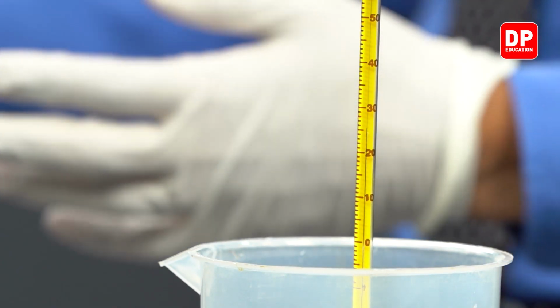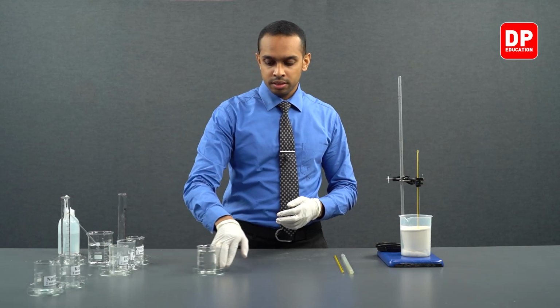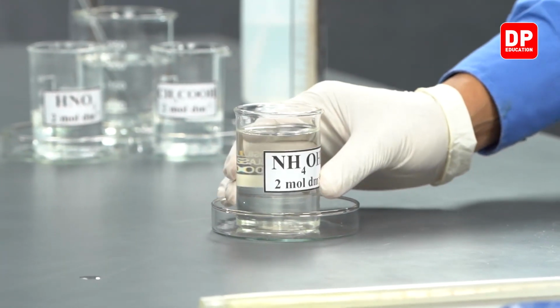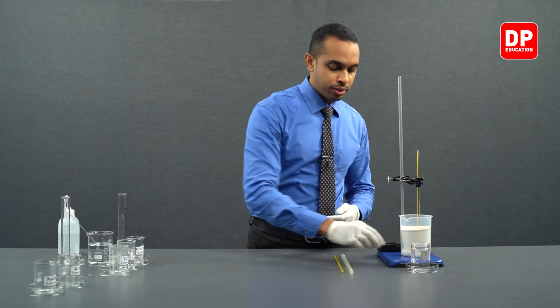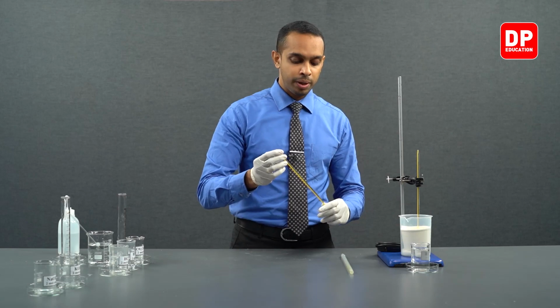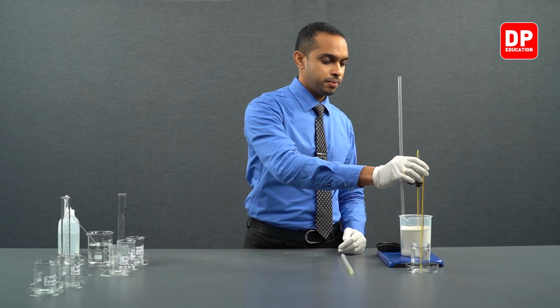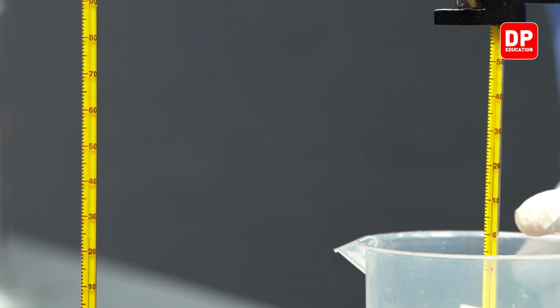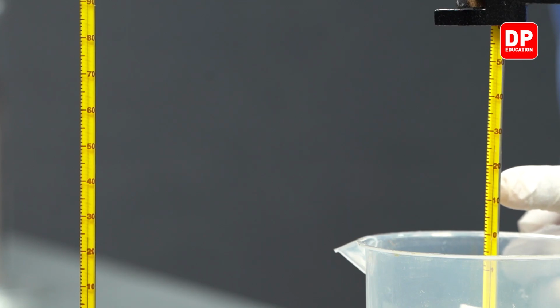While we measure the temperature of our hydrochloric acid, we can take ammonium hydroxide that we have here and measure the temperature of our ammonium hydroxide solution as well, so that we can compare the temperatures side by side. You can see in our HCl solution, the temperature reading is 26 degrees Celsius.